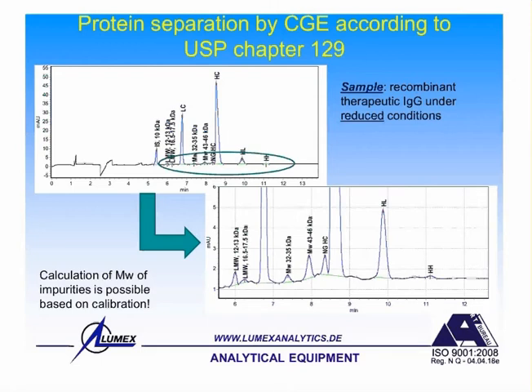If you take a machine like we have, capillary electrophoresis, and any other kind of separation technique like, I don't know, HPLC, the easiness, the simplicity is incomparable. You can easily start working with CE, and unfortunately, this is not the case when we talk about chromatography. It's a much more complicated technique.